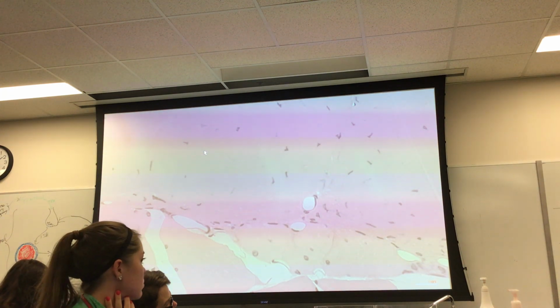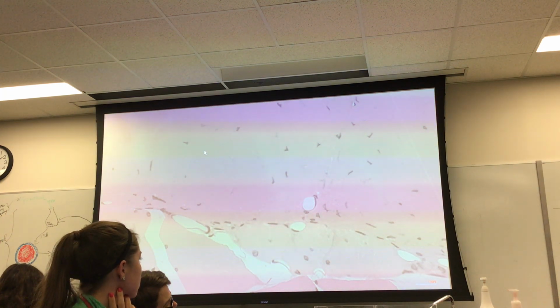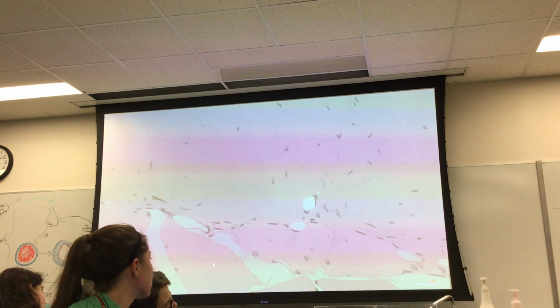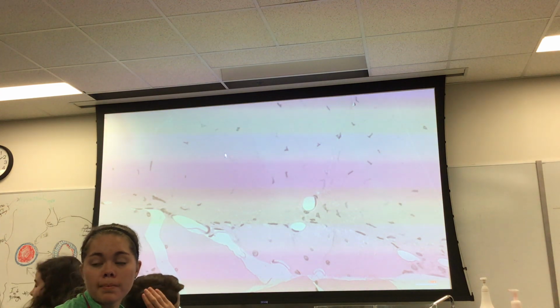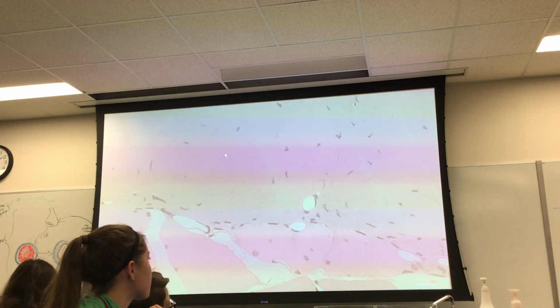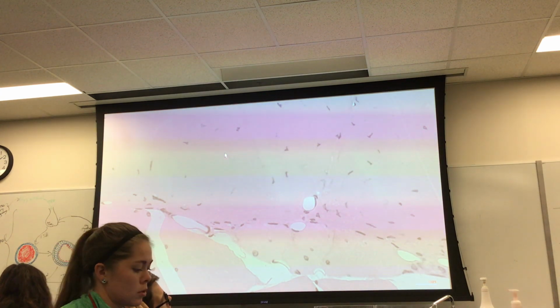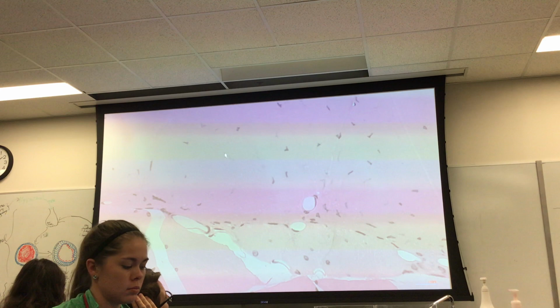Now, you guys use your brains. Think contextually. That means, what's the context here? You've got a skeletal muscle next to something that is not a skeletal muscle. So what's in the vicinity of skeletal muscles? Like bone, agreed. Is this bone?